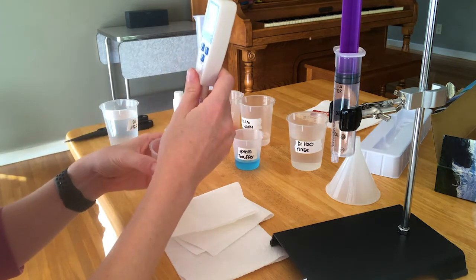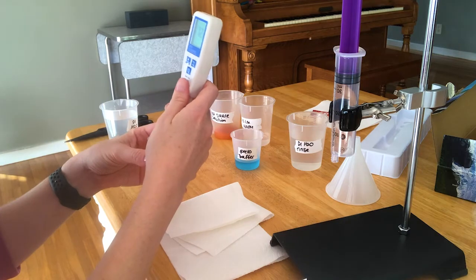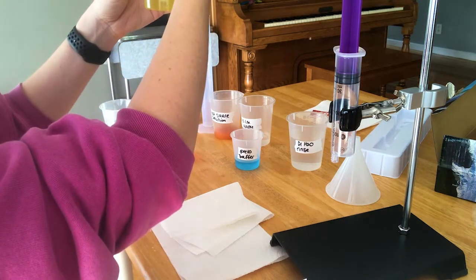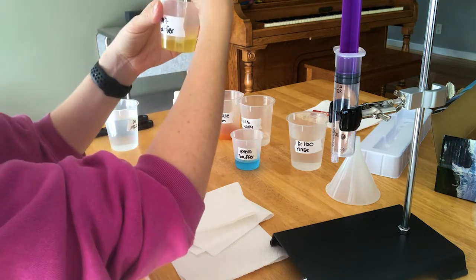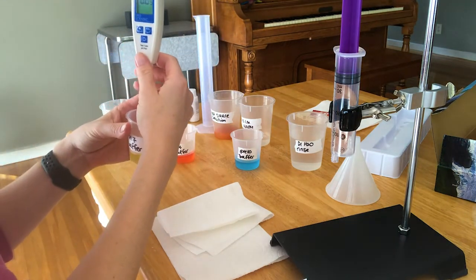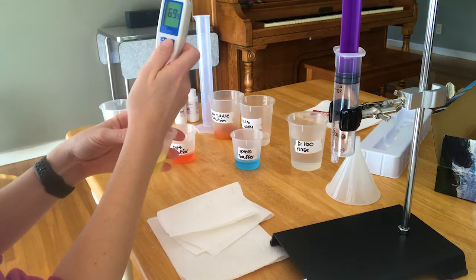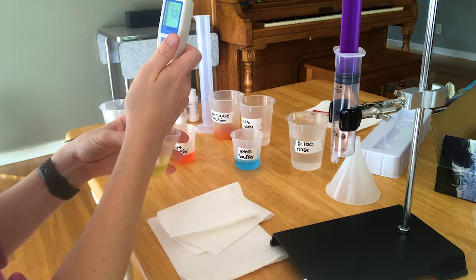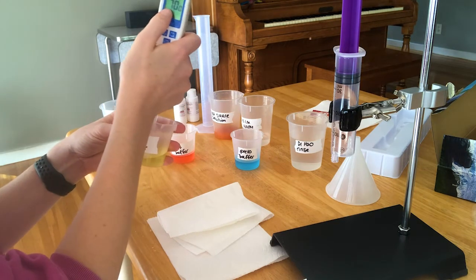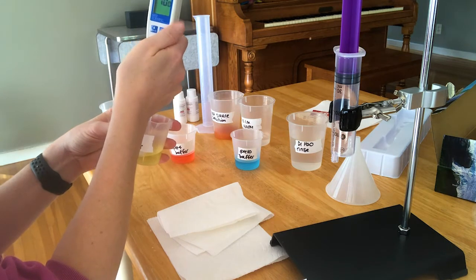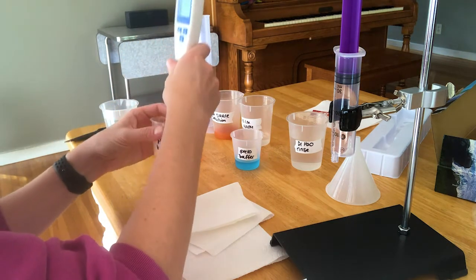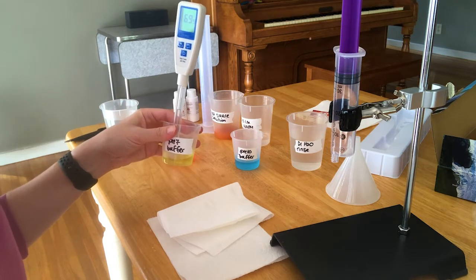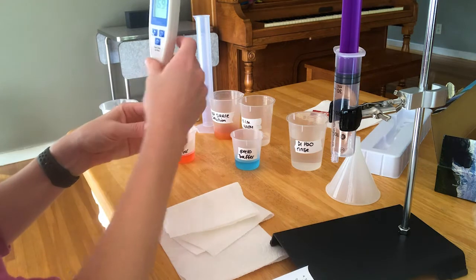First, start out with the pH 7 buffer. Make sure that that glass bulb is totally immersed under the solution, even if you have to tilt the beaker. Then you're just going to press this calibrate button. It's going to recognize that you're looking at a pH 7 buffer, so it'll say 7 on the face. And then I messed up here because you're supposed to wait until you get the message SA, and then it will say end when it's done. So I'm going to have to calibrate this one more time.